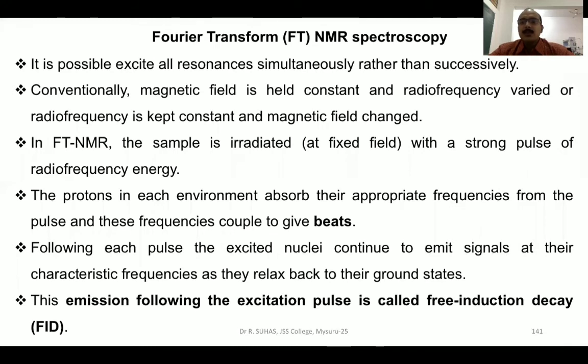So what happens? The protons present in every type of environment will absorb a suitable frequency from the radio frequency transmitter, and they will form a pulse, and these frequencies couple to give what is known as beats.